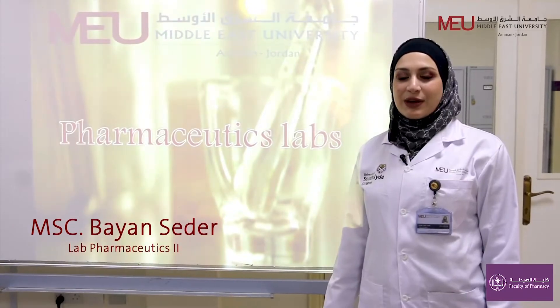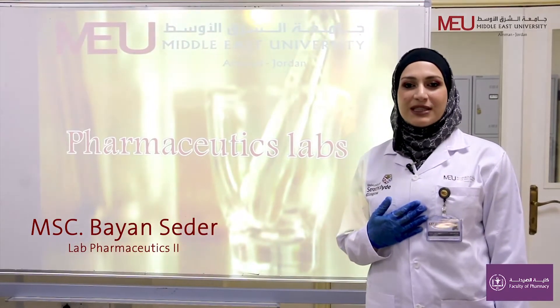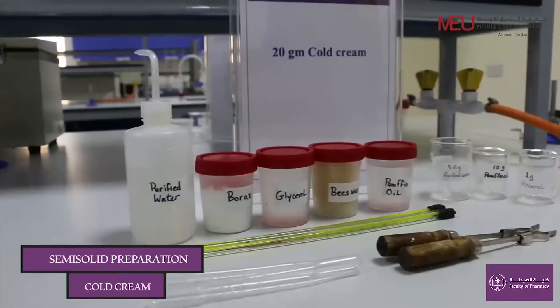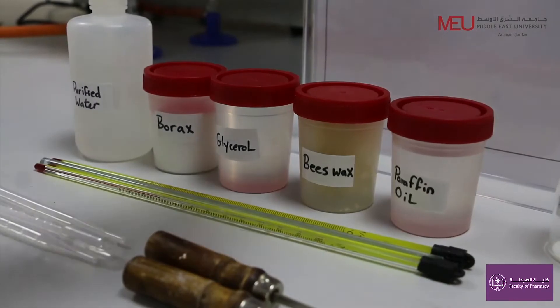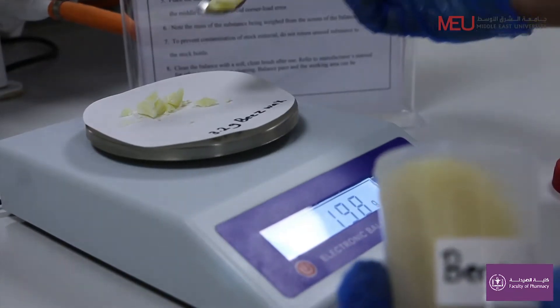Hello everyone, welcome to Pharmaceutics Lab. I am pharmacist Bayan Seder from the Faculty of Pharmacy at Middle East University. In this video, I'm going to discuss how to prepare 20 grams of cold cream. Weigh 3.2 grams of beeswax.